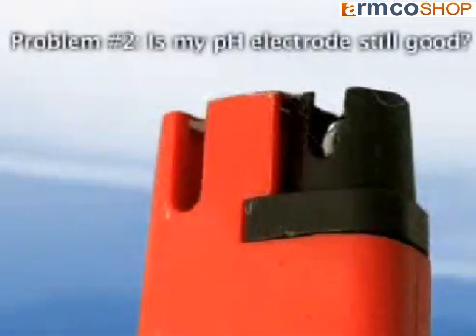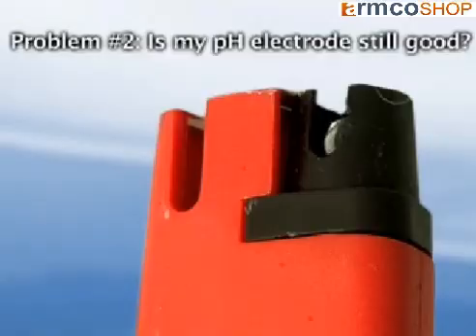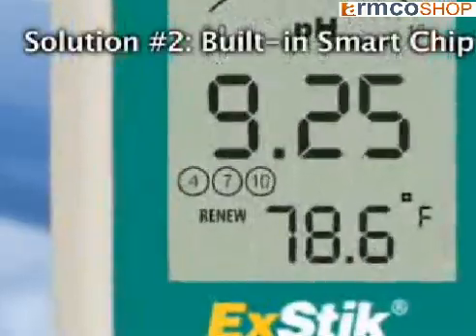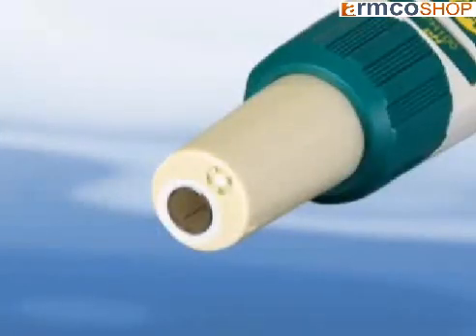Problem number two: uncertainty of not knowing how long the electrode will last and also the shelf life of storing an electrode. Solution: the built-in smart chip alerts the user when to replace or refill the X-DIC pH electrode. A renew indicator will appear when the meter senses the electrode not delivering optimal performance.